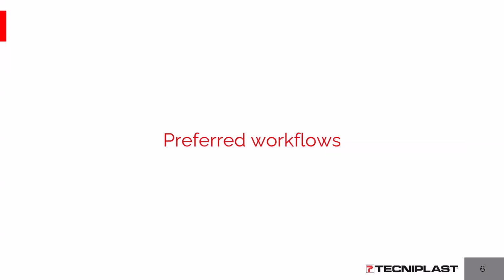As said, this interface runs on Google Chrome, so we don't install anything on your laptop or tablet. Probably you already know, but you have to bring your device close to the changing station, to the working bench surface, to interact in real time with the cages. Now we would like to share with you our preferred workflows, considering also the other components of the DVC ecosystem.